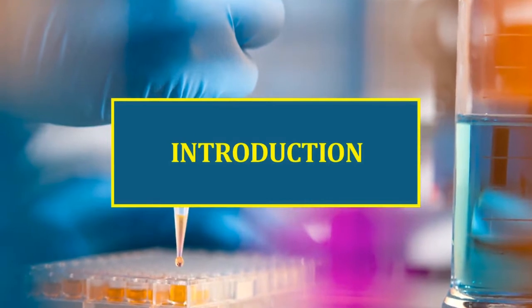Hello students, in this module let us learn about Introduction to Lab Safety, Micropipette use, solutions, dilutions and unit conversions. Let us first see the introduction. This lab module introduces the basic concepts of laboratory safety, micropipette use, solutions and dilutions and unit conversions.